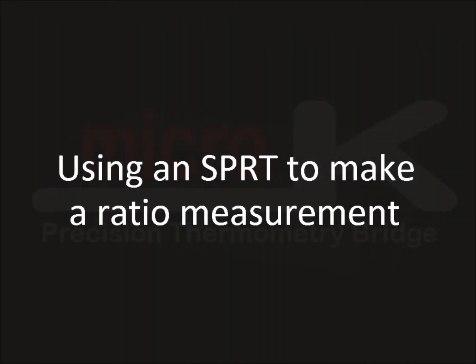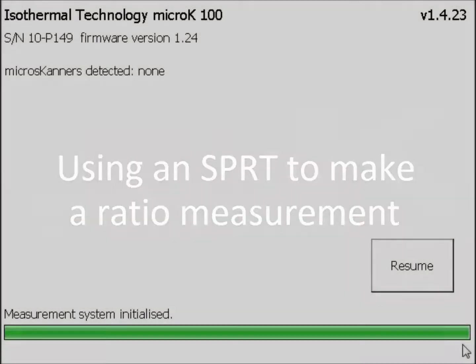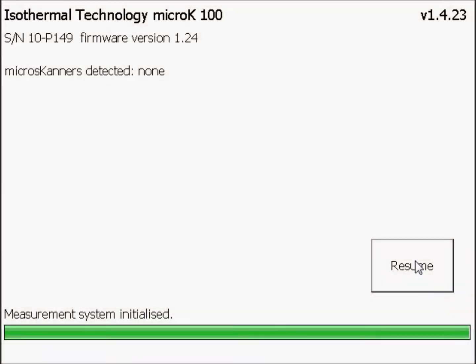Using an SPRT to make a ratio measurement. From Startup, press Resume to restart your micro-K. Press the Settings tab at the top of the screen.